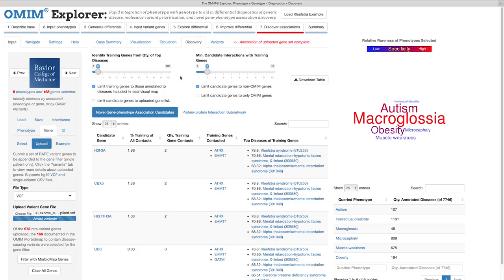In order to be a candidate gene, a gene's protein product must have at least two physical interactions with protein products of training genes identified from the top five disease matches. These default parameters can be modified here, and even allow for the restriction of discovery to only input variant genes not known to cause disease.